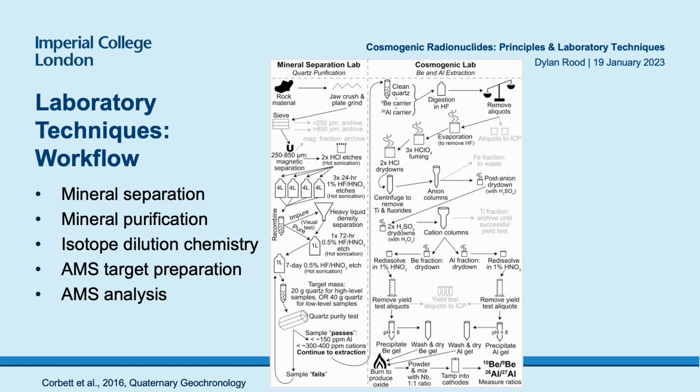So then with that in mind, and the motivation for why we are working so hard to get these laboratory techniques optimized, this is a very busy representation of the laboratory workflow, but there are basically just these main steps. There's the mineral separation, which is in this part of the diagram, and mineral purification, which is in this part of the diagram, which is mostly, in the case of quartz, acid leaching and etching.